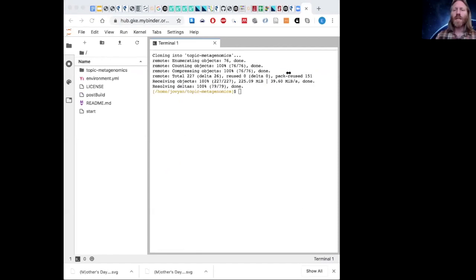So the goals of this demo are to demonstrate the usage of Kraken 2 for taxonomic classification using k-mers. Second, we're going to demonstrate the usage of a program called BBDuk, which is in the BBTools package, to do adapter trimming using k-mers. And the third is to demonstrate the usage of Krona for visualization of these classification results.